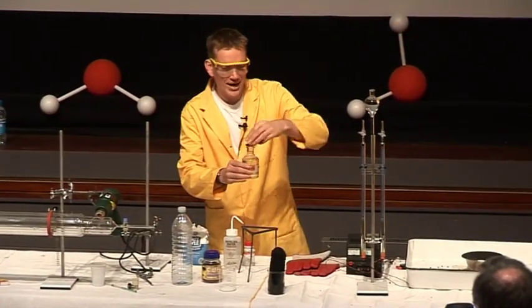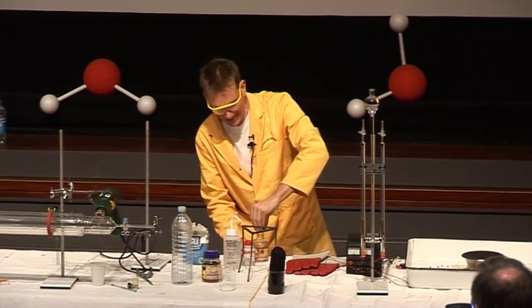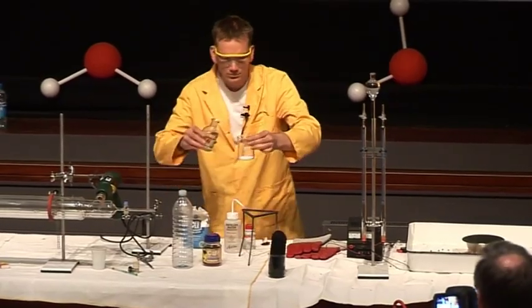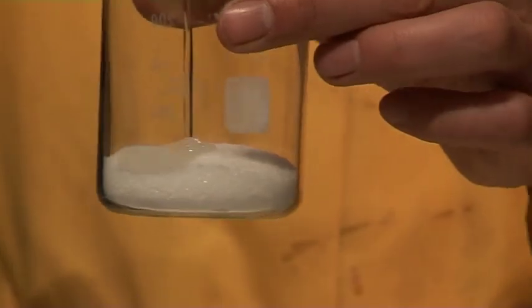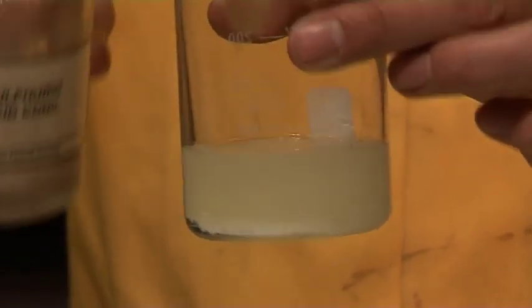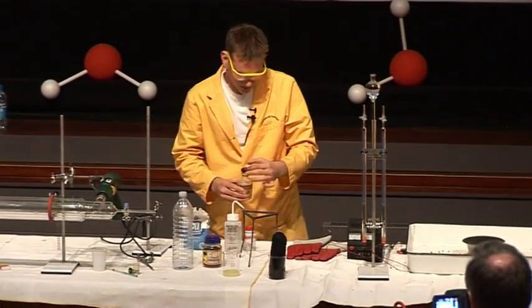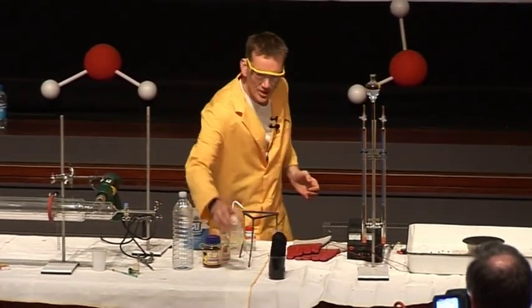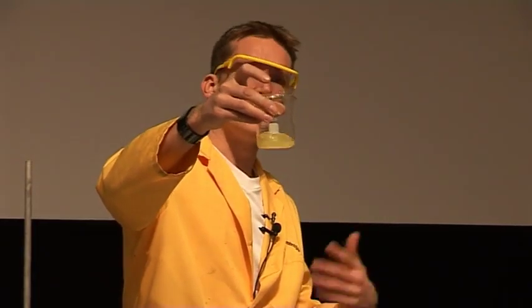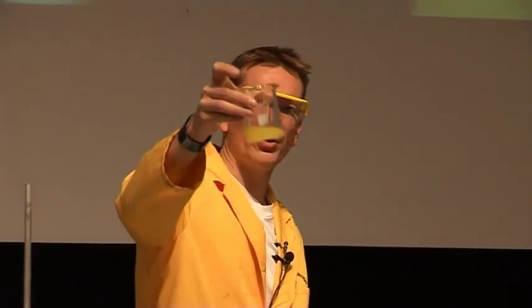So I have some acid here, and I'm going to add the acid to the sugar. And this is a bit of a slow reaction. This is one that we need to keep an eye on during the course of the lecture. So we can already see that the sugar has gone a sort of yellowy colour. This is much the same way if you're heating up some sugar, it caramelizes, it goes sort of brown first of all. Well, this is what's going on here.